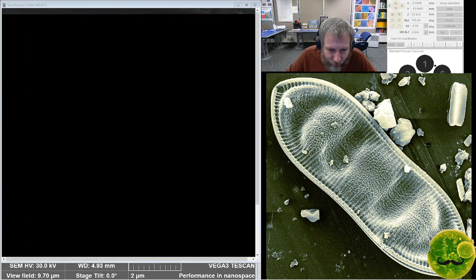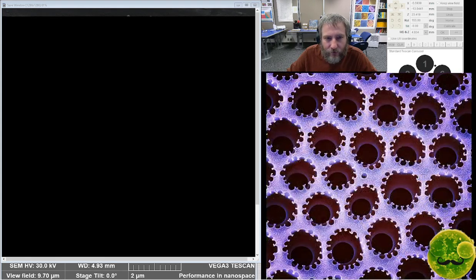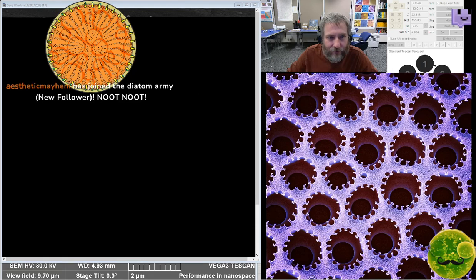Are there ever samples embedded in rock core samples? Yes, Quiglis. We look at the diatomaceous earth around here occasionally. I have some ancient samples that are 10 million years old that are back here behind us.